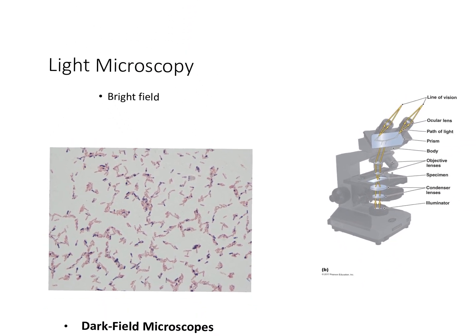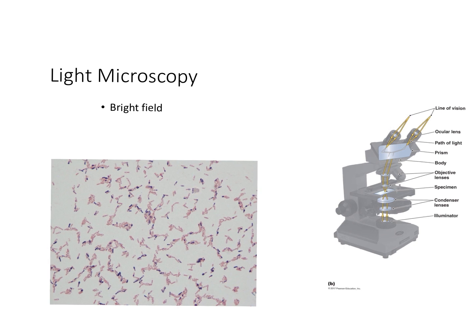Obviously, a bright field microscope is going to be the most common kind of microscope used. These are the ones that we use in lab. Okay, so most common, we typically see a light background. Typically, we're going to stain cells. Now, it's possible to stain the background and not the cells, but assuming that you haven't done that, the background's going to be light. Typically, we can get our magnification up to about 1,000 times as the limit there, and a resolution of about 0.2 micrometers.